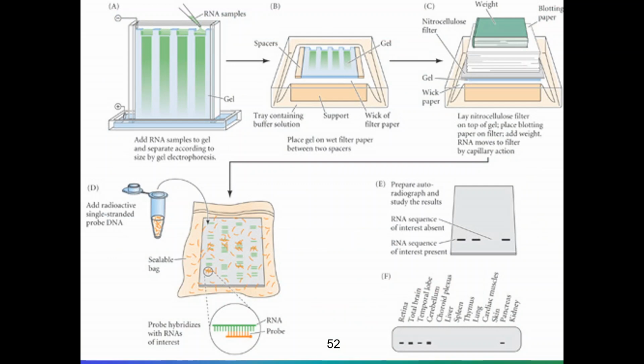The idea here is that we use northern blotting to identify how much, relatively, RNA there is in a biological sample, like bacterial cells or human cells, and so on. So here's the idea: we take a sample, like cells, and we open it up, releasing all of the RNA molecules. We take the RNA molecules.